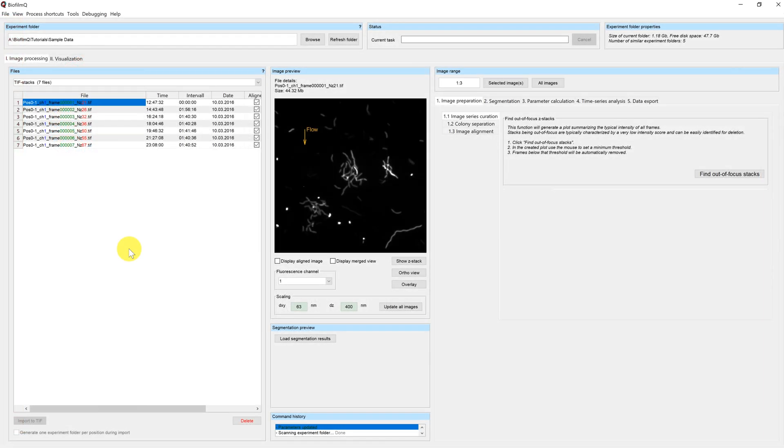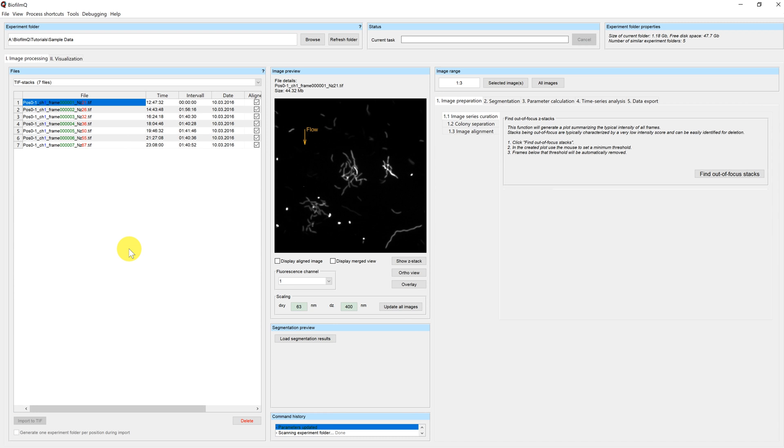Welcome to this BiofilmQ tutorial, in which we will learn how to convert your data files into a file format suitable for further processing with BiofilmQ. In previous tutorials, you have learned how to download BiofilmQ and how to open the GUI and load a directory. So we will start from there.